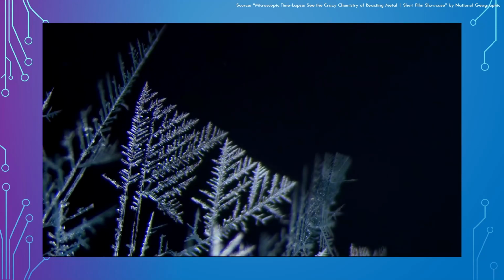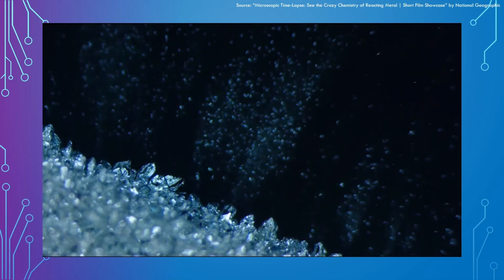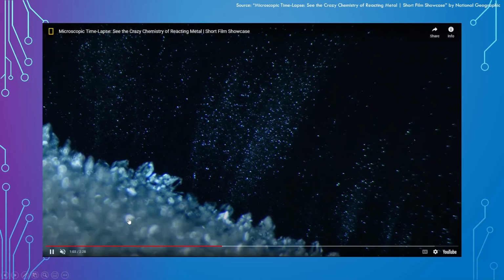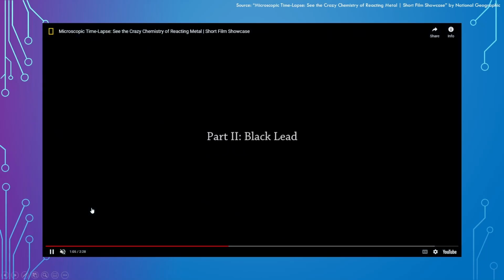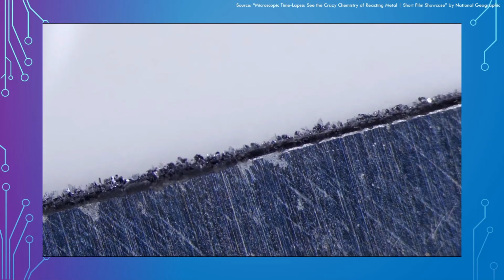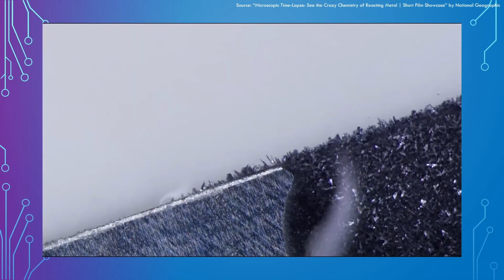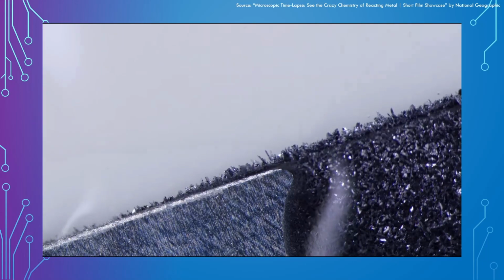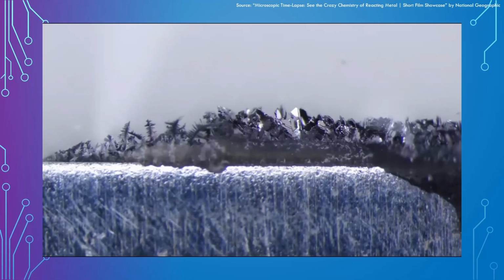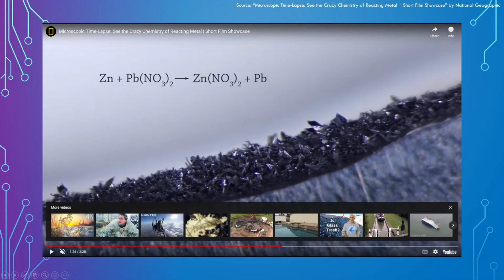And this phenomenon is for all kinds of cameras, normal picture ones like you'd handle yourself, but also with microscope images as well. So wouldn't it be handy if we could somehow construct an image that is focused for all distances away from a sample? And that's what we're going to be trying to tackle today in this tutorial. So let me stop the video here.